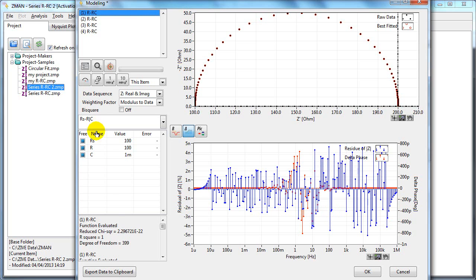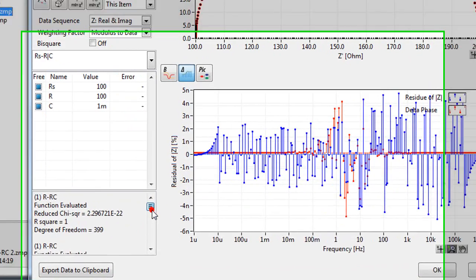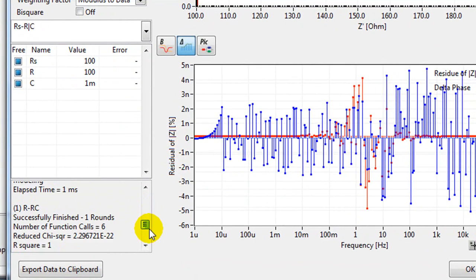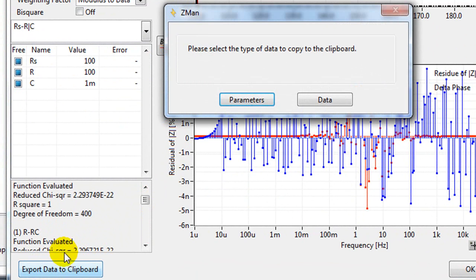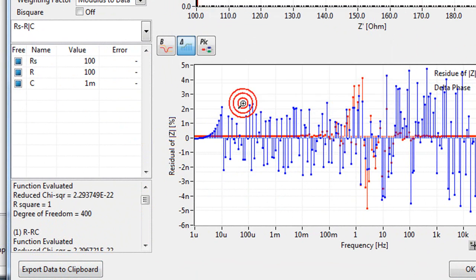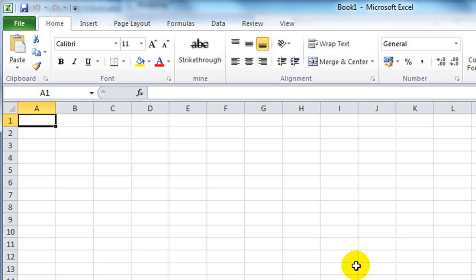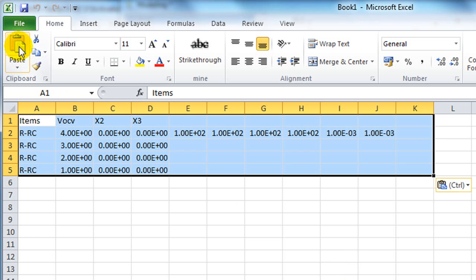Every fitting process is logged in the log here. You can export the data to the clipboard. For example, the parameters. And in Excel, you can paste those parameters in.